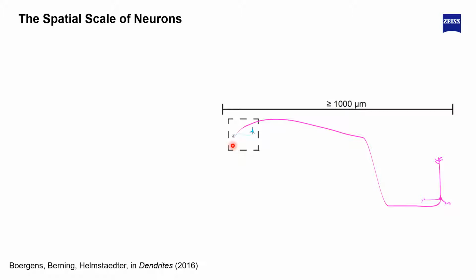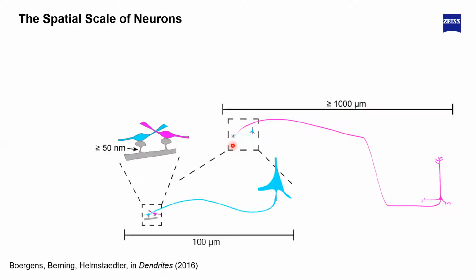indicated here. And both of them eventually target this gray cell. They form axons, again, a more regional cell, something that is not spanning its axons that far away, both forming connections here on those boutons, those thickenings, with, in that case, what you're seeing here are spine heads. And those are the connections that we would like to understand.